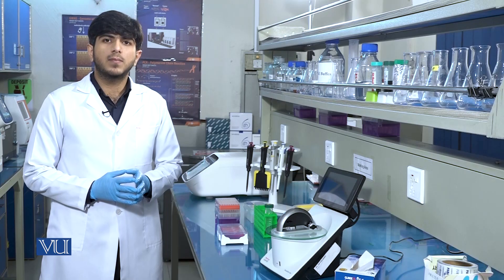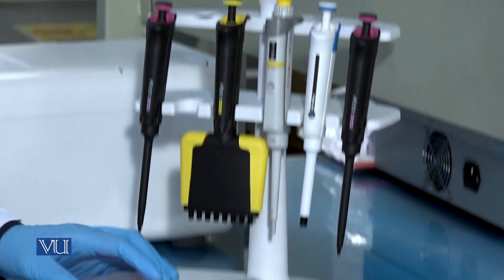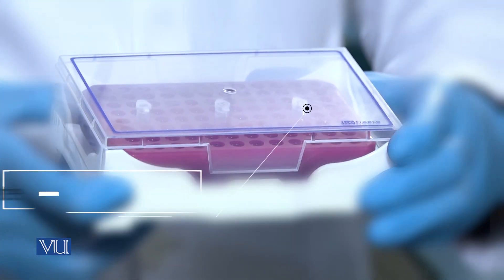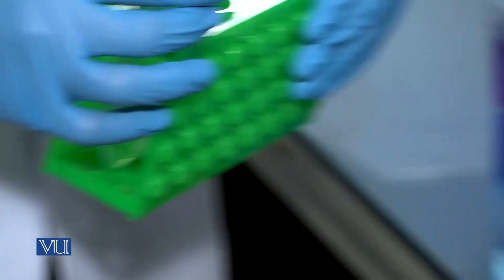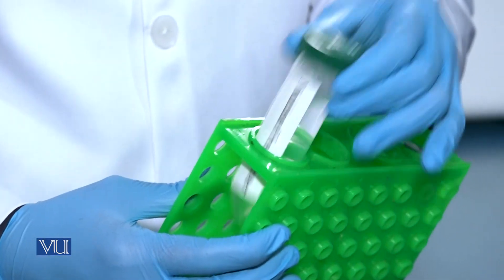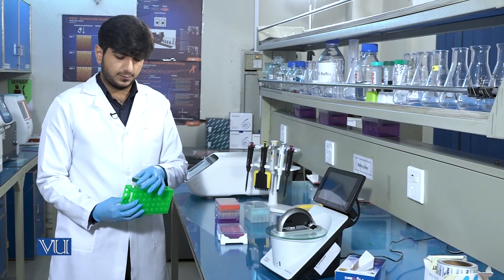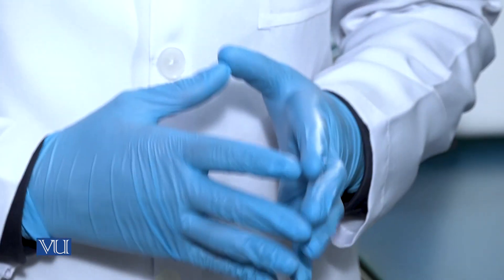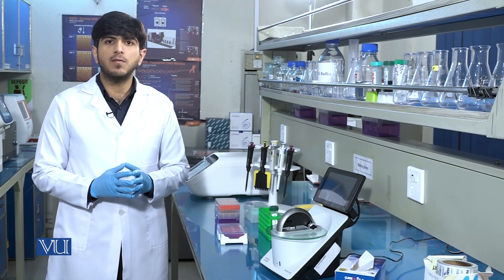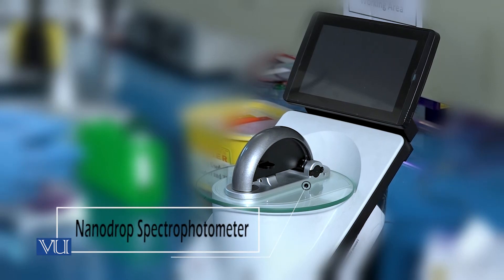To quantify the DNA in a sample, we need pipettes, pipette tips, a DNA sample, and a blank sample which is nuclease-free water. The purpose of nuclease-free water is to blank the instrument. We are using nuclease-free water because we have stored the DNA in nuclease-free water, so we will blank the instrument with it. Finally, we have the NanoDrop UV visible spectrophotometer.